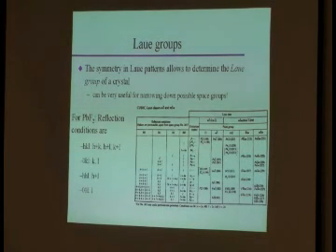Well, remember how we went through systematic absences and how some people said, do I have to list all of these groups? Here are the reflection conditions for PbF2. Let's see whether we can figure out in which line of the table we have to move. You have your own tables, plus this one is in your handout. So everybody take about a minute and try to figure out what line of this cubic table is actually the line where PbF2 would fall, based on its systematic absences.